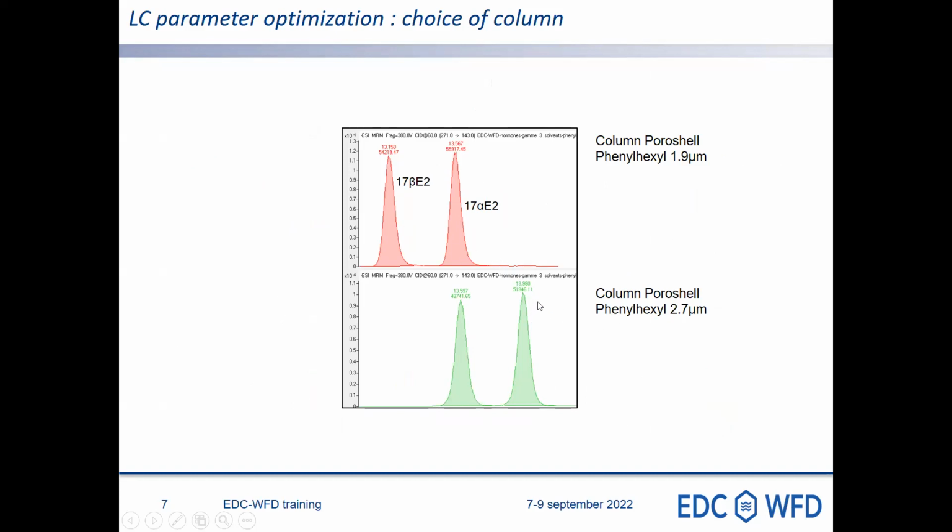So it's really manageable. You can achieve it either with isocratic or with gradient approaches, but both are really successful. So it's easy to really achieve this separation.